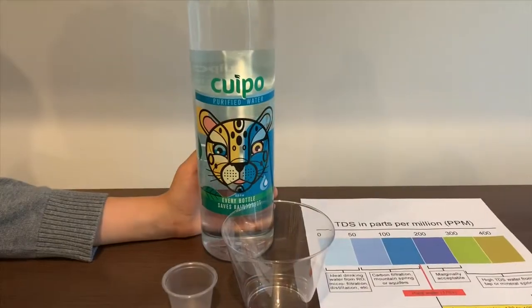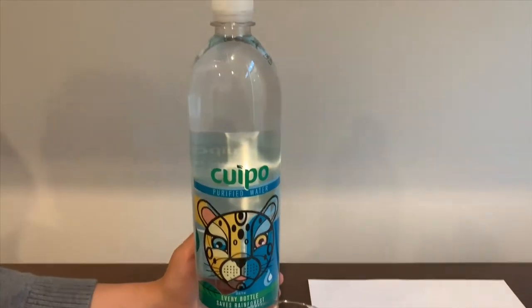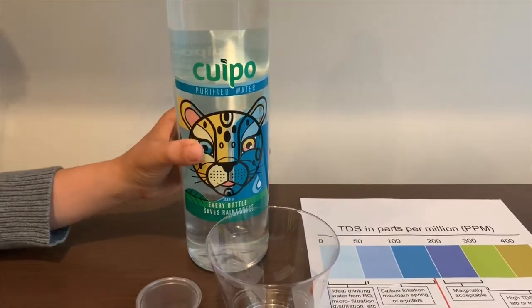This is Cuipo Purified Water. It's sourced from municipal sources in California. Let's check the TDS and pH level.